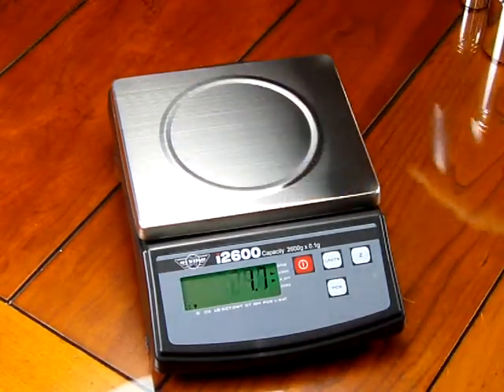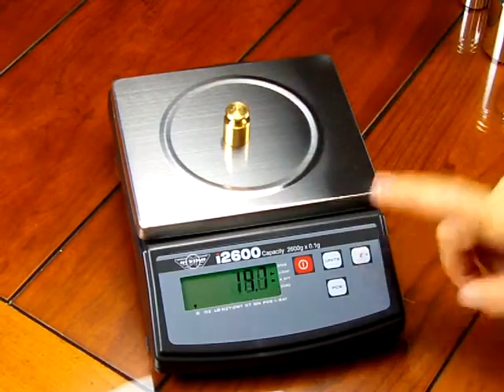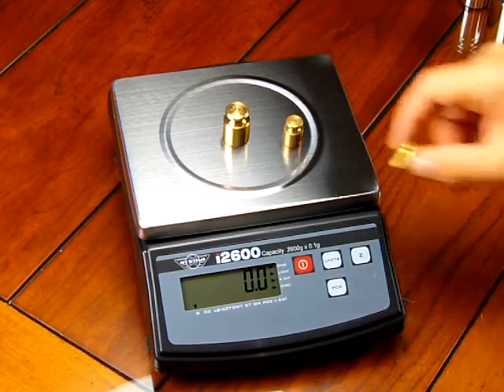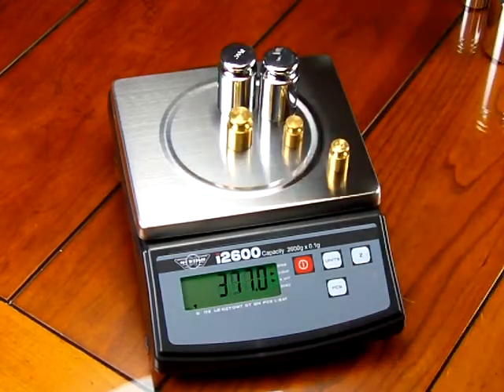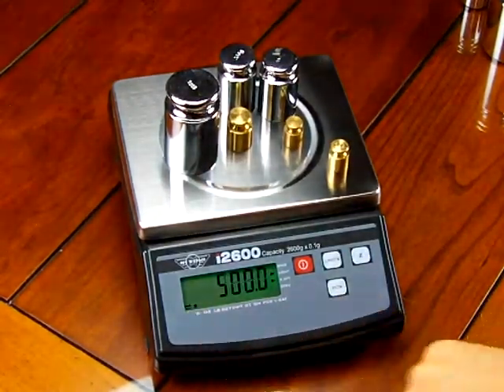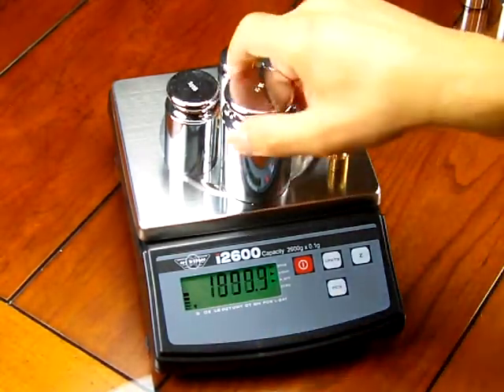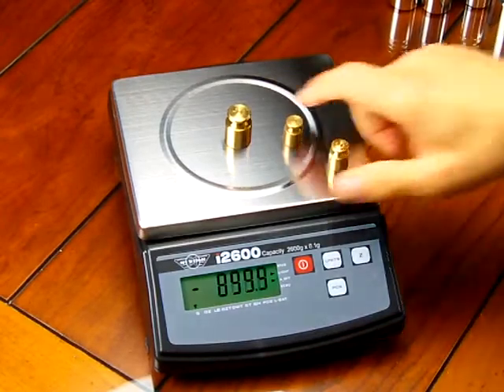Some other functions the scale offers: you have the ability to do parts counting mode. It has a tare key — if we put a weight on, we could tare it out, put on another weight, and zero that out. You can do this until the full capacity of 2600 grams. You can do multiple tears. The weight guide gives you an idea of how much capacity you've used so that you don't overload the scale. As you keep putting more weights on, you can see the weight guide going up and up.